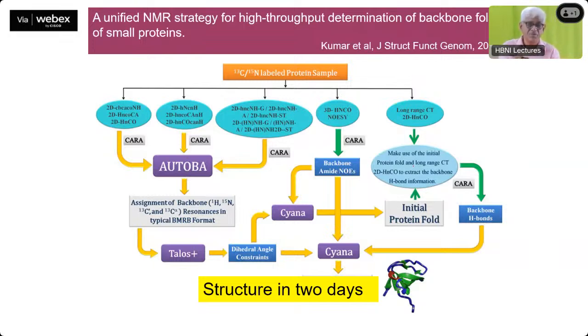So it was our dream that as you get the data, you also get the assignments, because you can put the AUTOBA software on your spectrometer. So automatically it picks up the data and then it should do that. Of course, before we could do that, I retired. And all the students who were there, they also ran away. They left. And incidentally, this AUTOBA software was written by an MTech student.